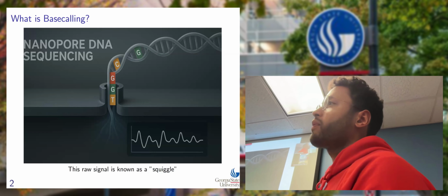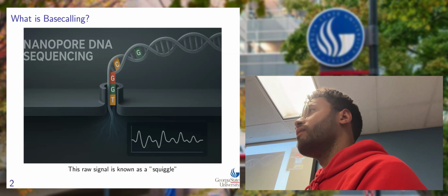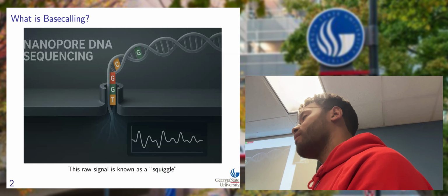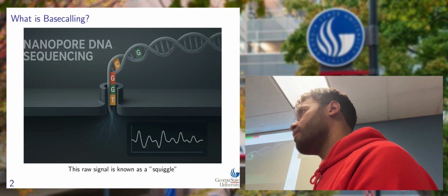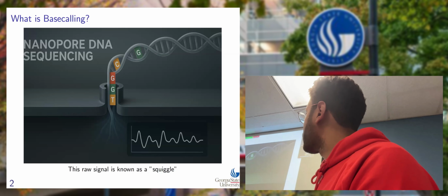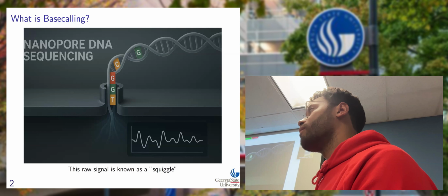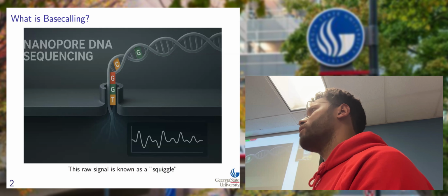So the reader itself is really huge. The head of the reader does not read a single base effect. It will take a bunch of effects that correspond to a bunch of characters, rather than a single character passing. And even recently, they started to double that reader, with two readers next to each other. One of them reads the first few characters, and the next reader reads the next few characters. Is that the duplex? No, duplex is something else.